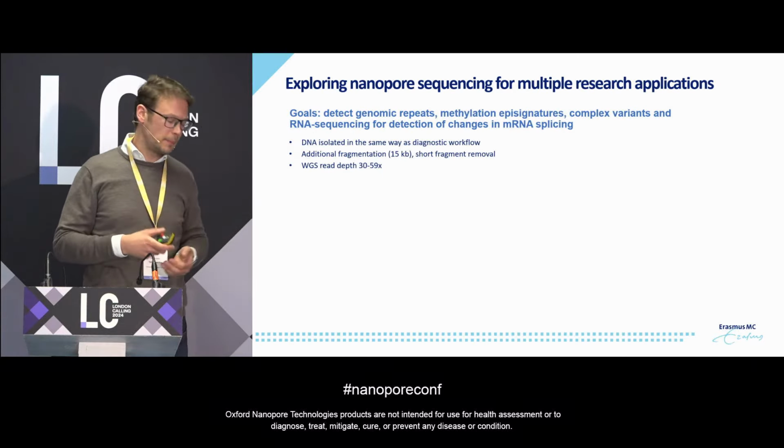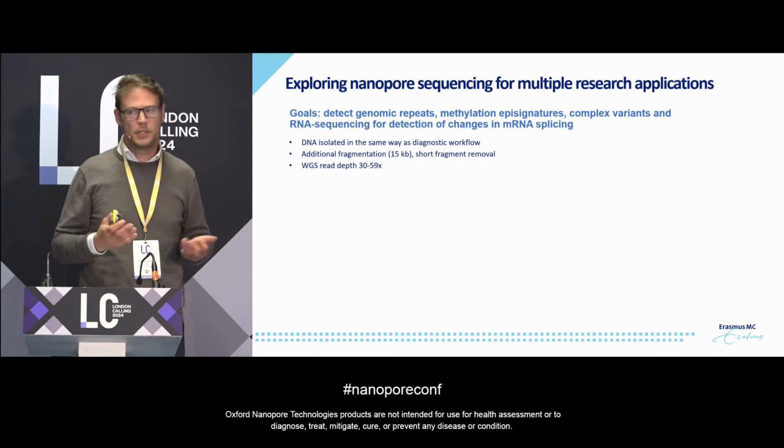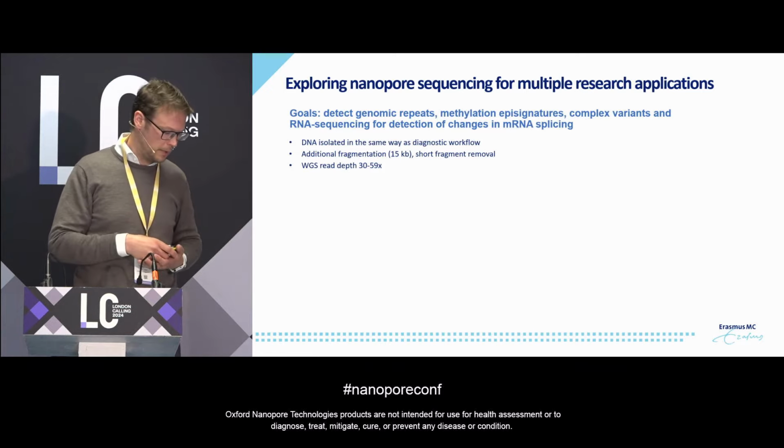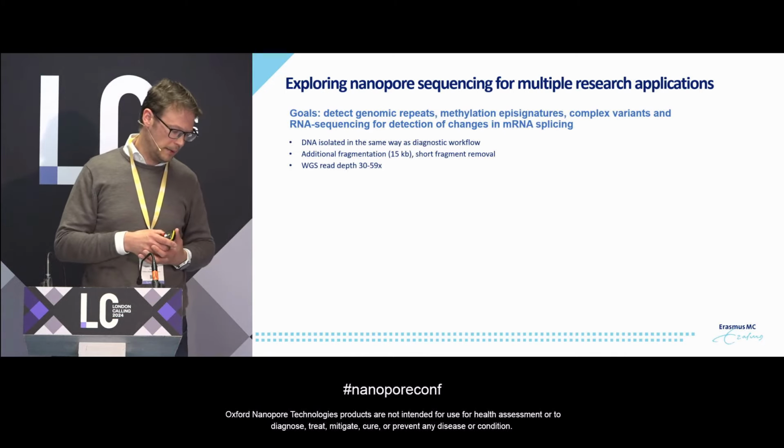So, okay, now back to the reason I'm here. We are exploring nanopore sequencing for a couple of research applications, including detecting repeats, looking at methylation episignatures, for example for Kabuki syndrome, complex variants, and particularly also for RNA, obviously.